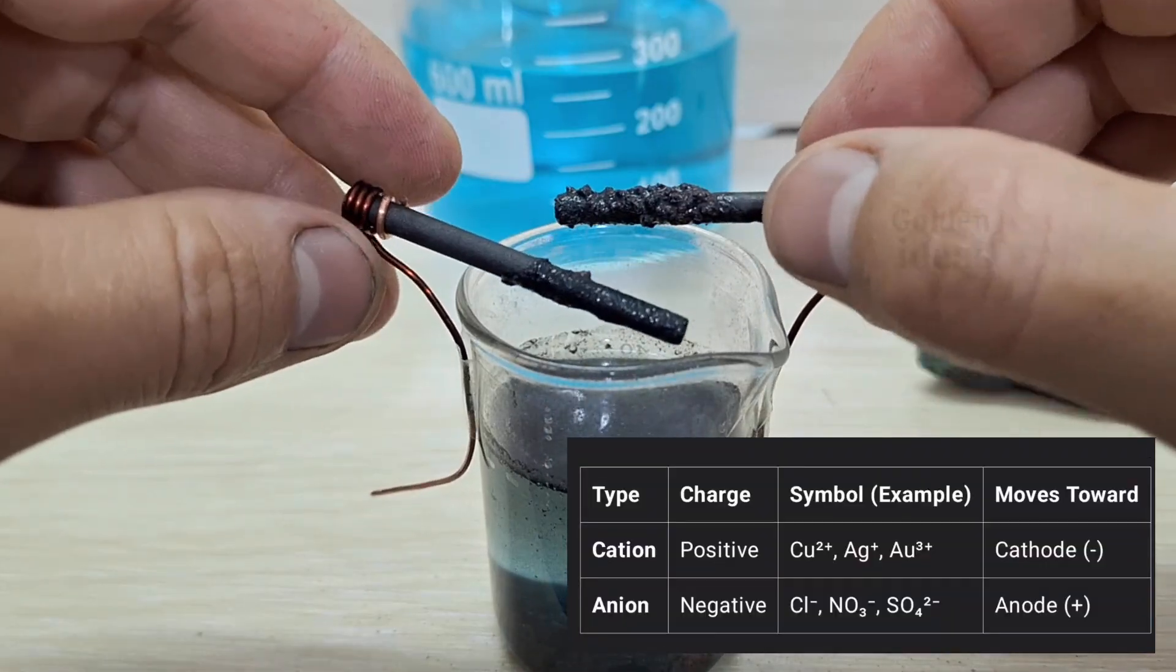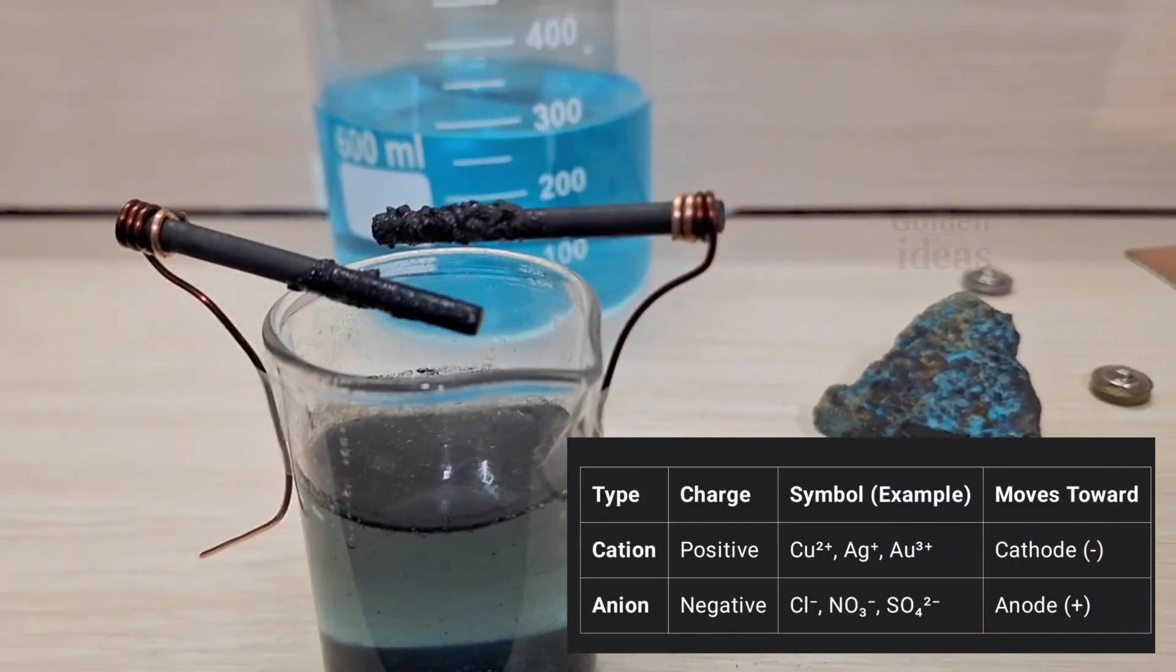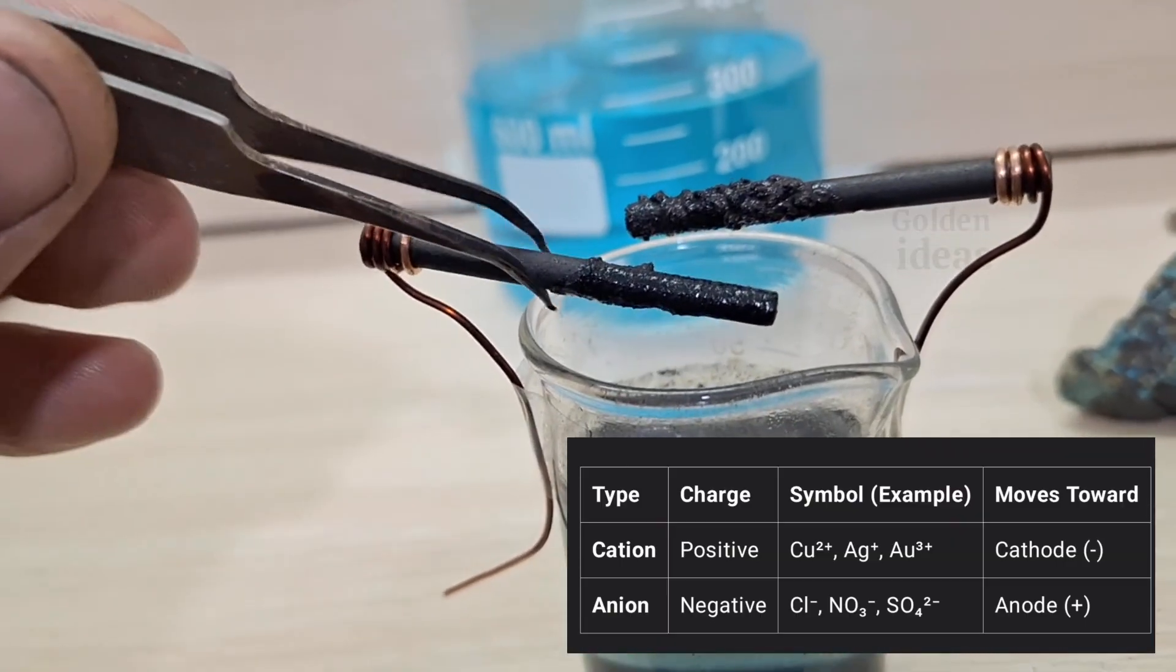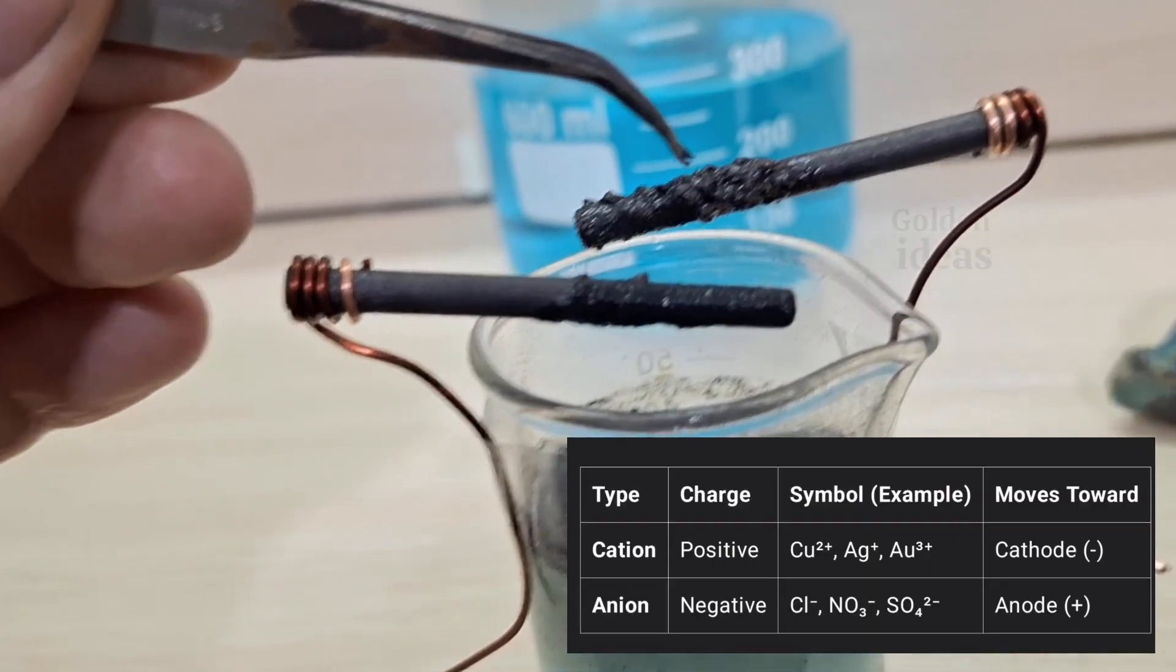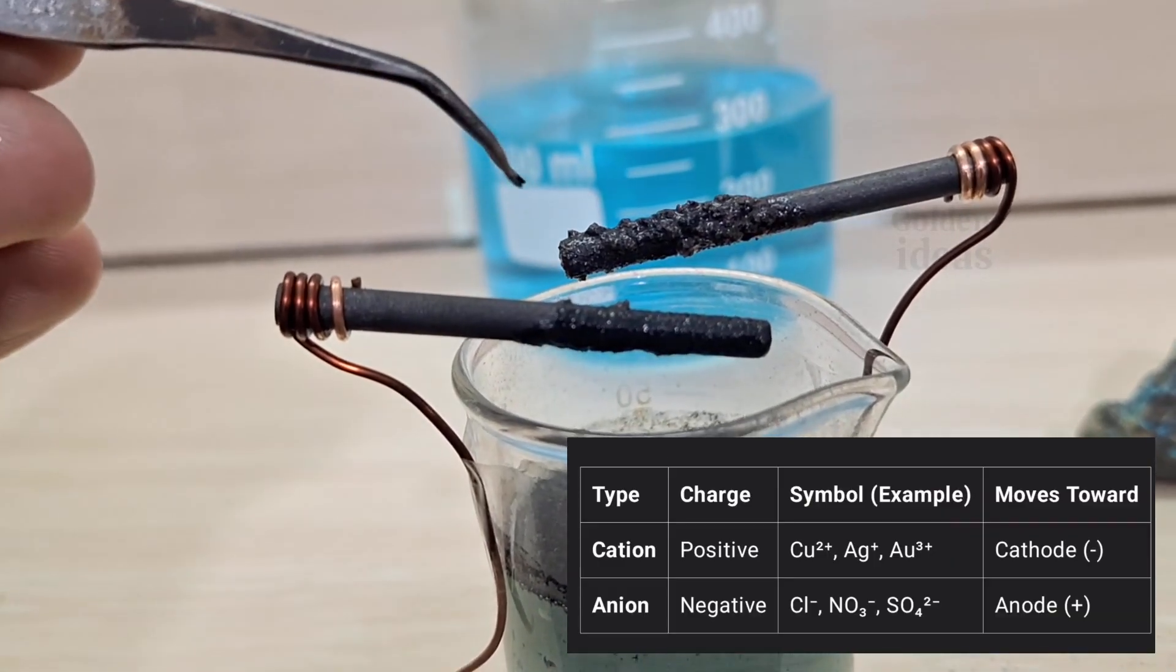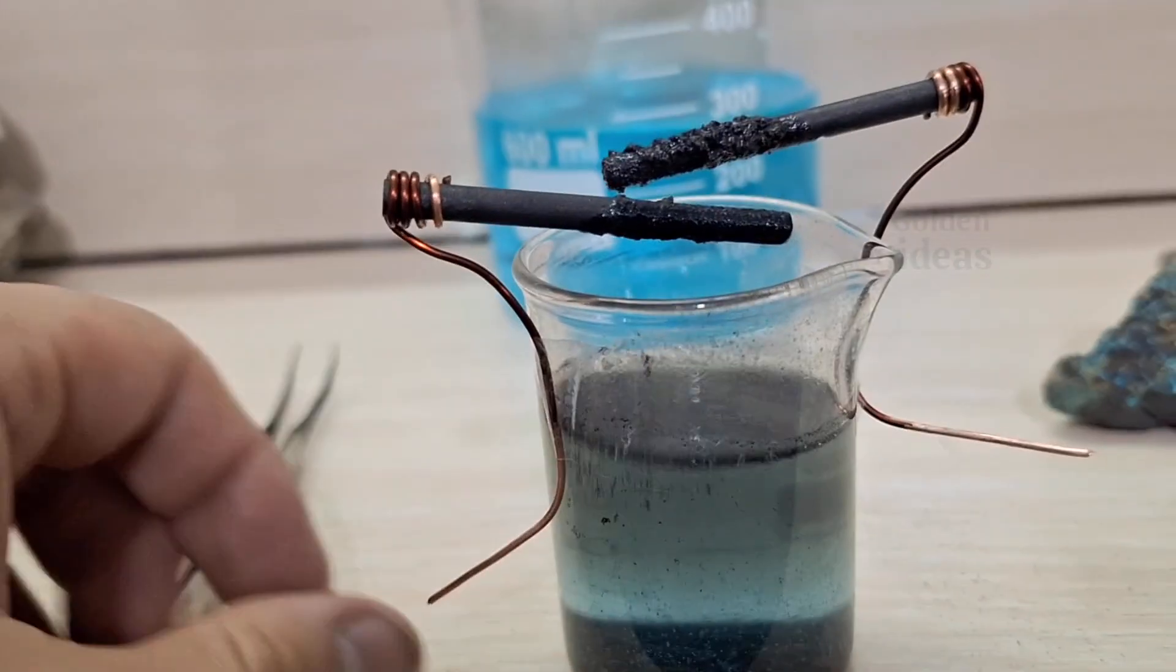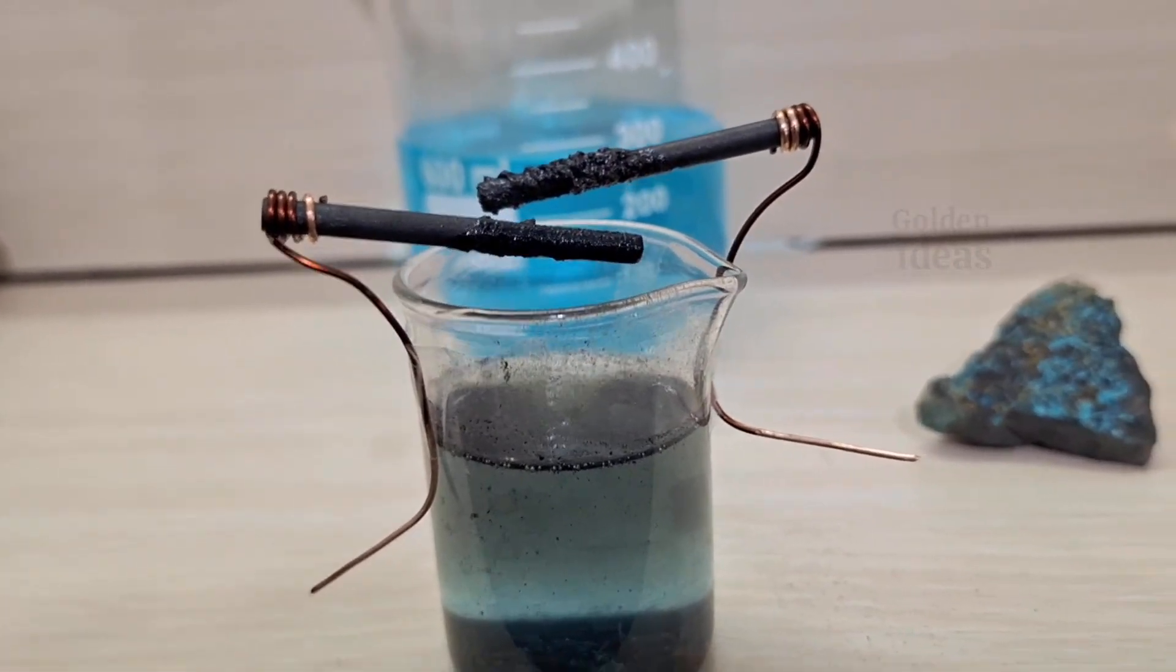Friends, if you take a look at this table, you might find the answer to the question we raised. This table shows us under what conditions certain elements may deposit at the anode, and others at the cathode. However, keep in mind that in this setup we did not use a reactive metal as the anode, both electrodes were made of graphite. If you use a metal electrode that dissolves in acid, then almost everything will deposit at the cathode.